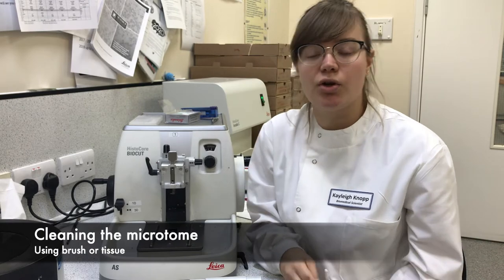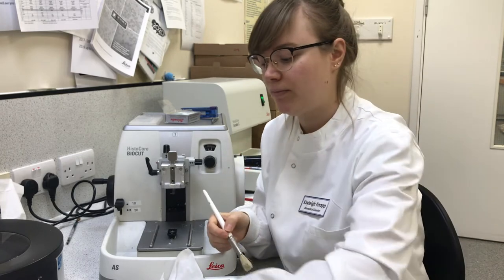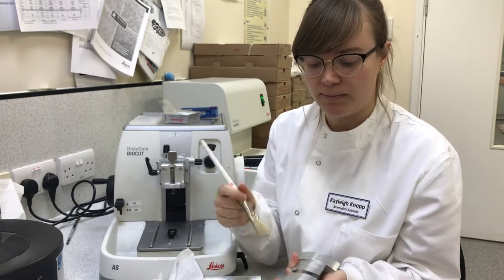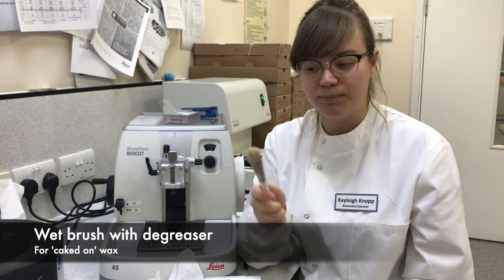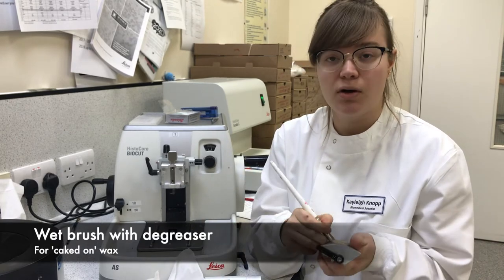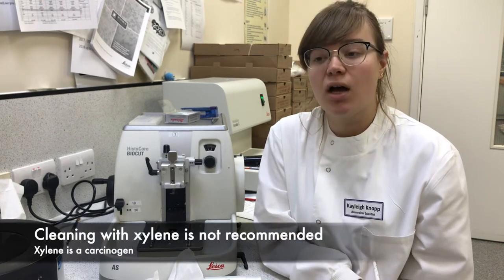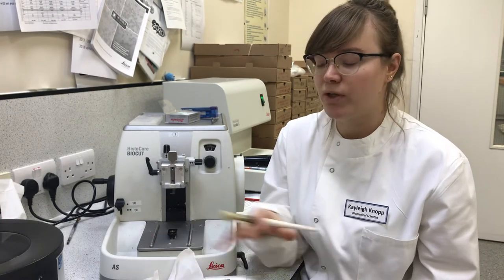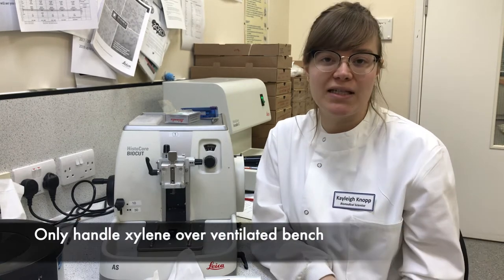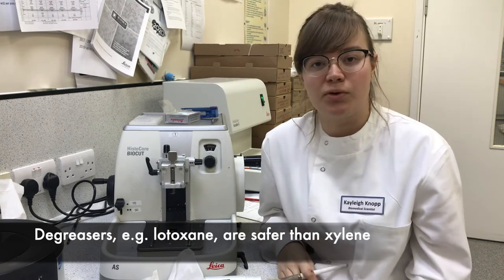To clean these parts, you can either use a tissue or a brush to get to those hard-to-reach areas. First brush dry to brush any particles away, or you can use a degreaser such as Toxane to wipe away the wax. You can clean a microtome with xylene, but this is highly unrecommended due to the carcinogenic nature of xylene. If you do wish to use xylene, do it over a ventilated bench with the appropriate PPE. Histology companies sell degreasers with a lower toxicity so that you can keep yourself safe.